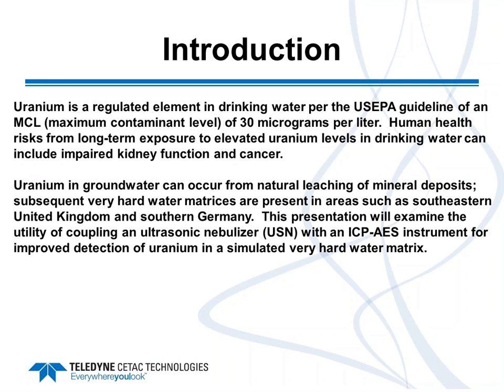Uranium in groundwater can occur from natural leaching of mineral deposits, and it came to our attention that very hard water matrices from this natural leaching are present in areas such as southeastern UK and southern Germany. So this presentation will examine the utility of coupling an enhanced nebulizer system, that being an ultrasonic nebulizer, with ICP-AES for improved detection of uranium in a simulated very hard water matrix.